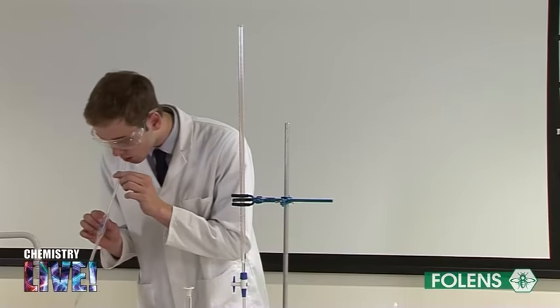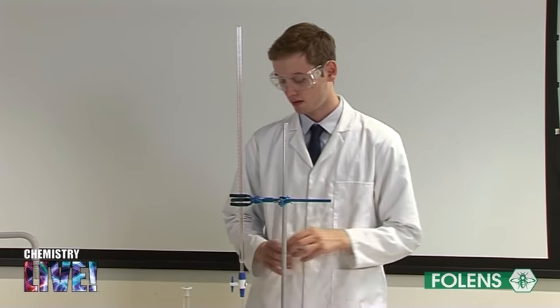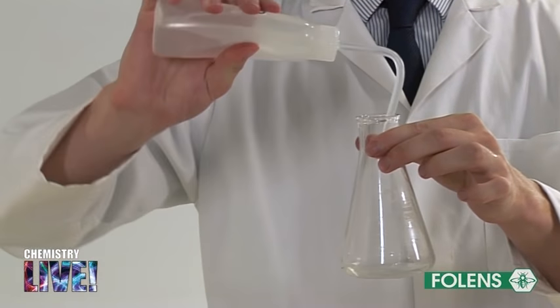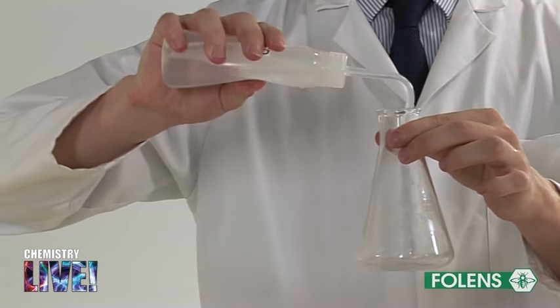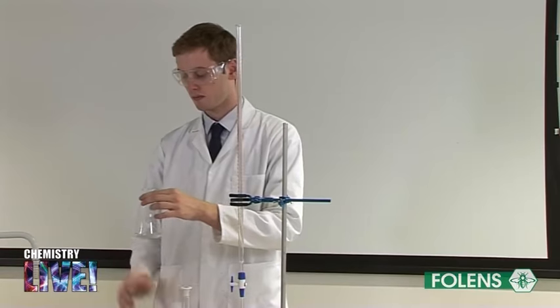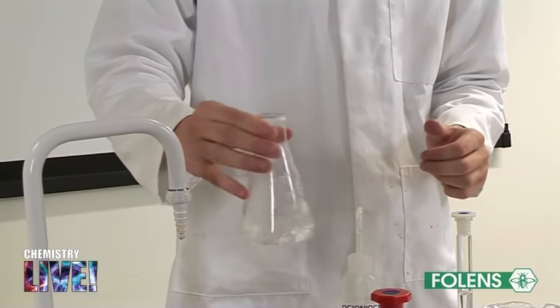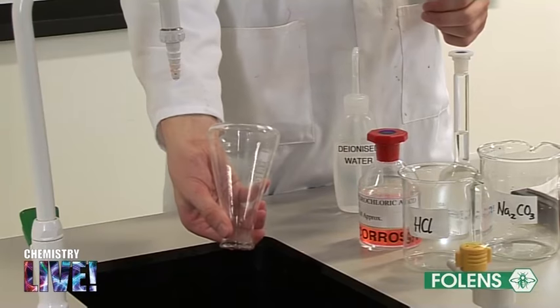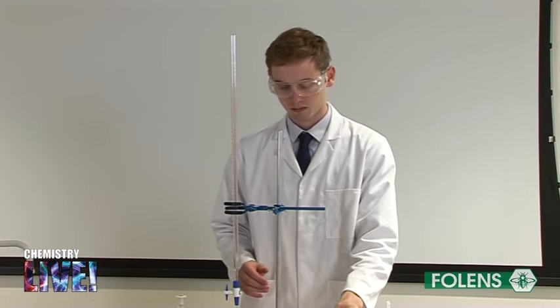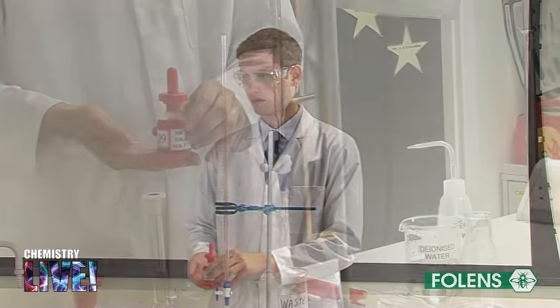Since this is the first titration that we are doing, we will go through the procedure in detail. You will be doing lots of other titrations, and it is recommended that you always follow this procedure. For this titration, we use the indicator methyl orange to determine the end point of the titration.